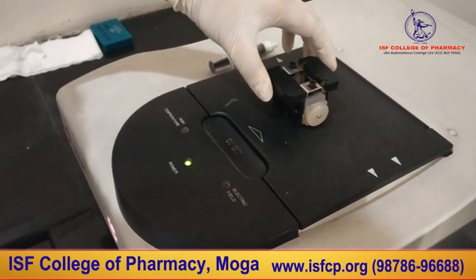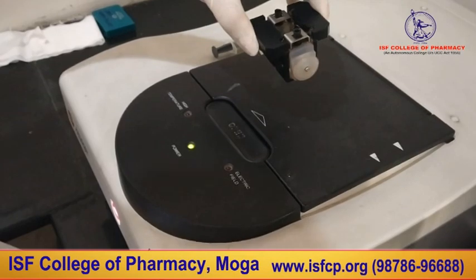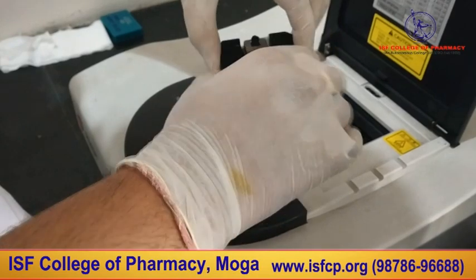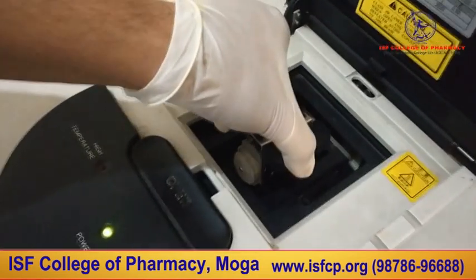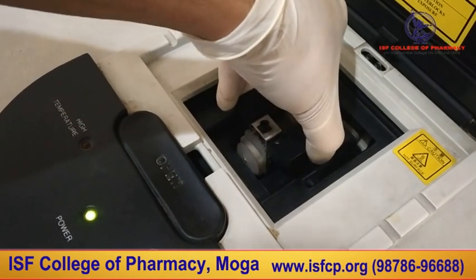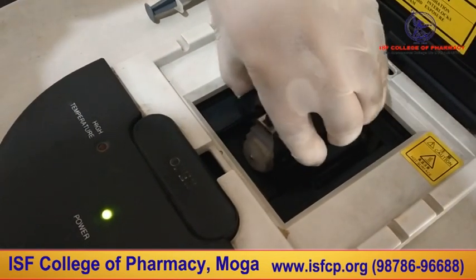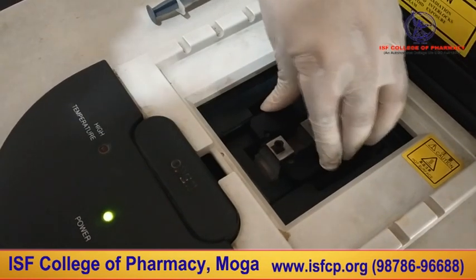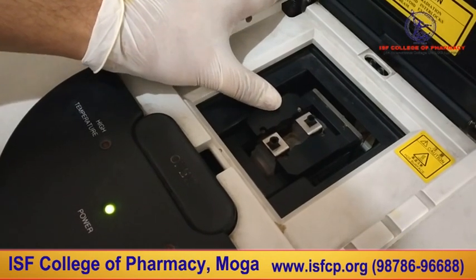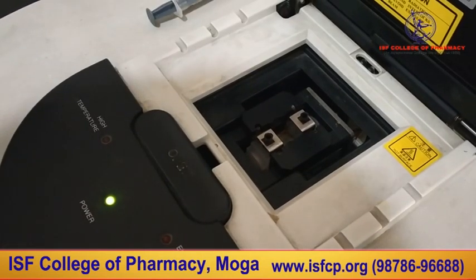Now we are going to place our socket inside our Delsa Nano C instrument. As I already told, it is too delicate, so we have to place it very smoothly. After you hear one click sound, that means the socket has been placed properly. Now close the window.